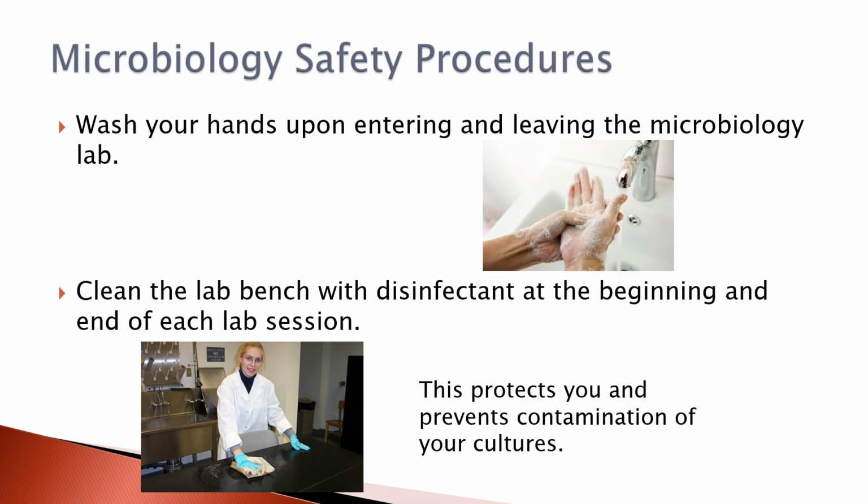This whole idea of cleaning the lab bench is going to protect you and prevent contamination of your cultures. So we always assume that the lab bench is dirty when we come in, even though we know that the people that were there before us cleaned it up. At least we hope they did. So we always assume that. So we always clean it when we come in, and we always clean it when we leave.